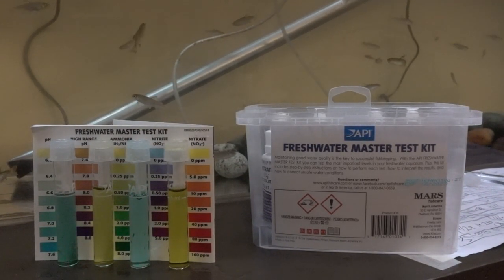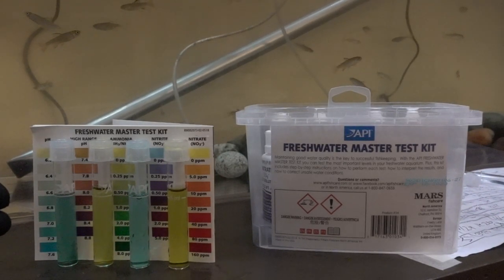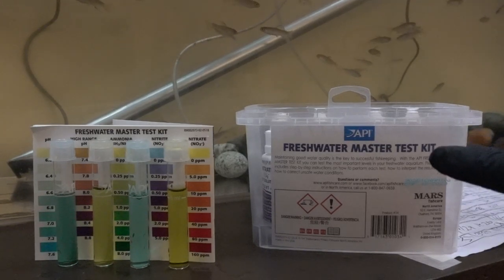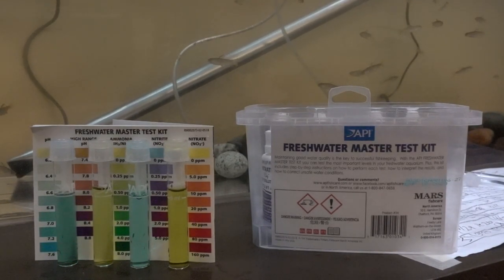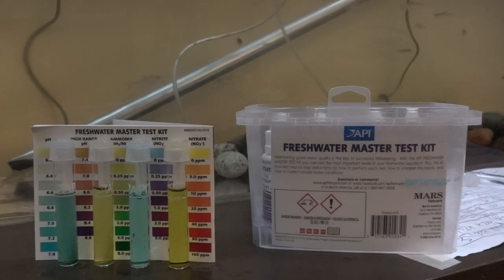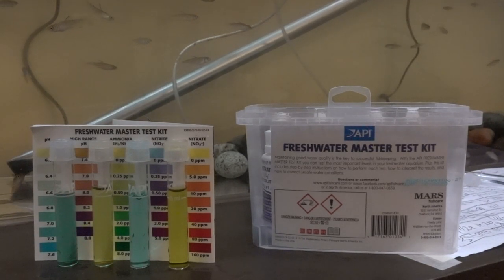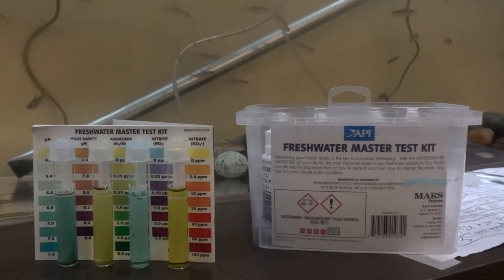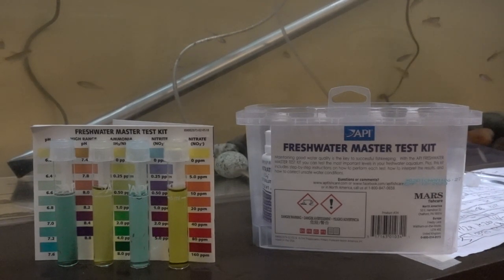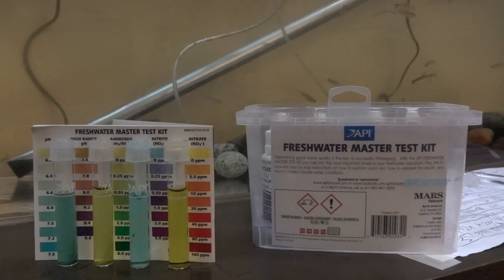Hey there, Lake and Park. Here's a quick video on some tank chemistry for you. Here's an example of a test completed here — I'll move you a little closer so you can see these levels. We've used the freshwater master test kit, which I talked about in a previous video about pH. In this video we've also tested for ammonia, nitrite, and nitrate, which are all going to indicate the levels of waste in our tank and tell us about the health of the bacteria in our tank and how often we need to do water changes.